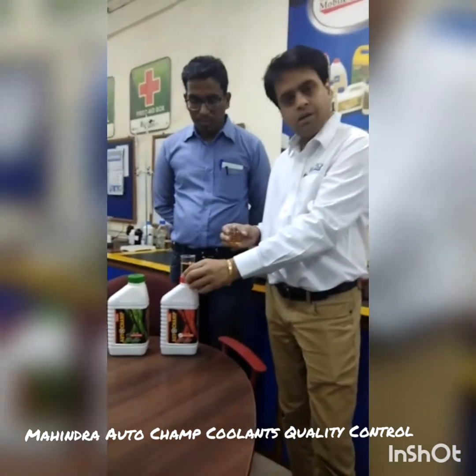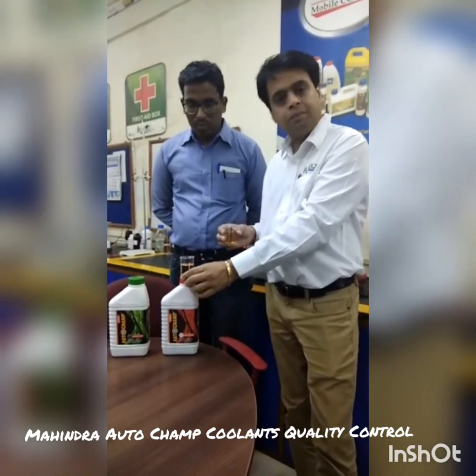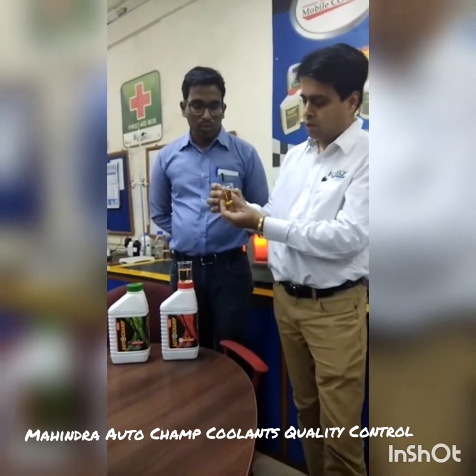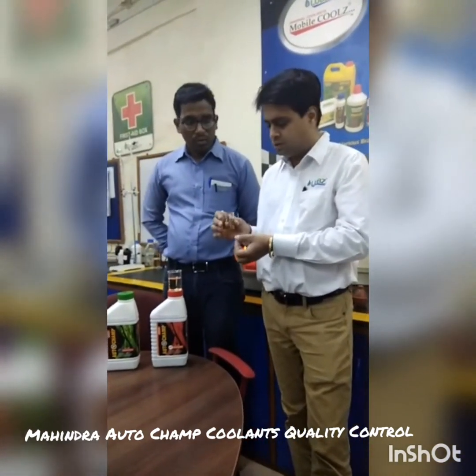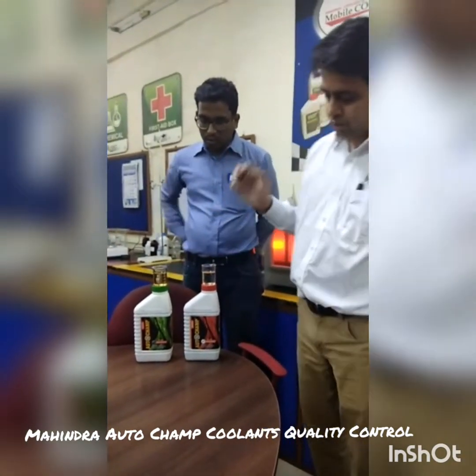This is a product from a company called Preston — a Swedish company — and also BASF Manufacturing System. This product is used for manufacturing of the green hoodant. This is called Ethoxylate, code name CO40, and this is used to manufacture this product.